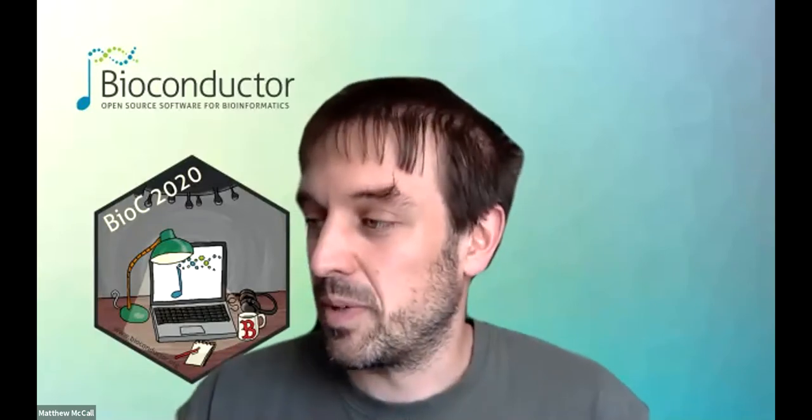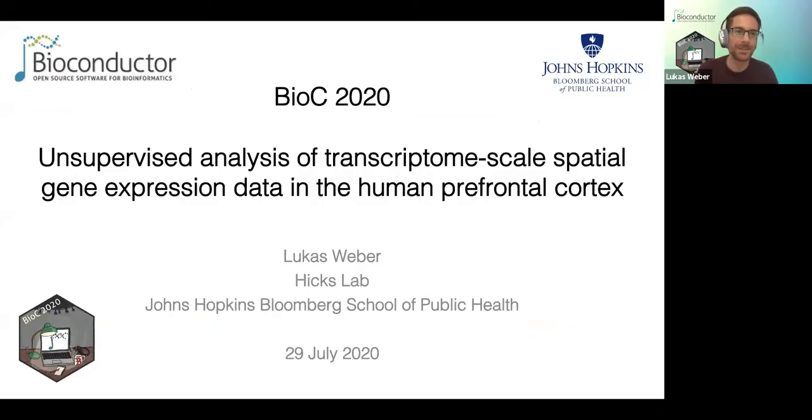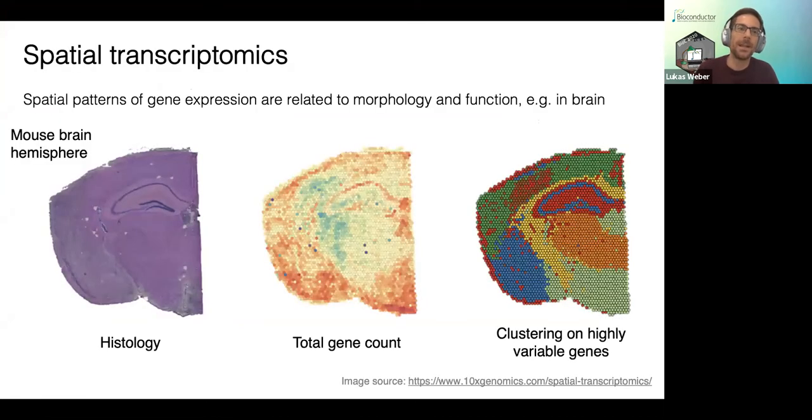And so the first talk today is by Lukas Weber. Thanks very much for having me here to talk today. So I'm a postdoc at Johns Hopkins University now. I'm going to talk about work we've been doing on developing unsupervised analysis pipelines for spatial transcriptomics data in human brain. And we've just had, I think, the keynote talk before this about spatial transcriptomics, so it's great timing.